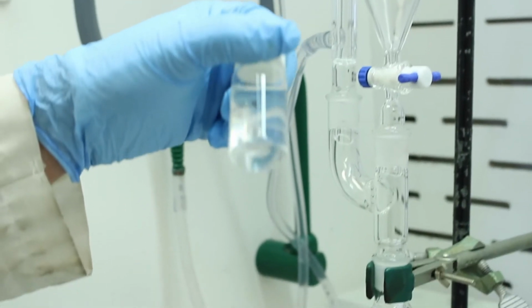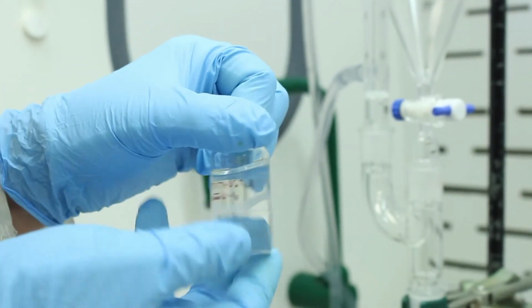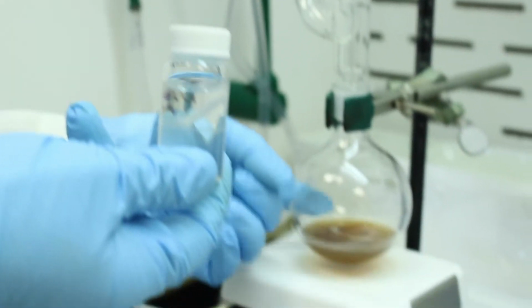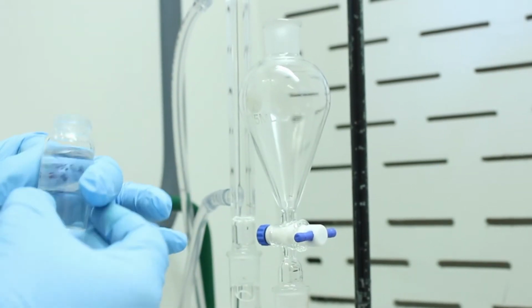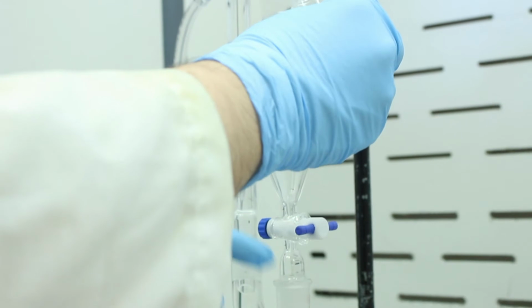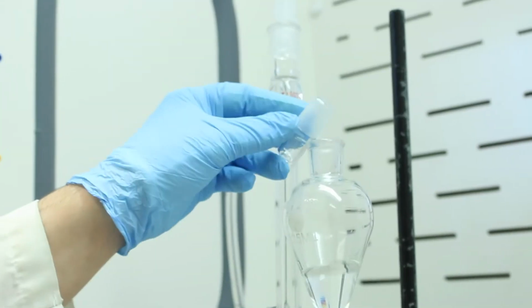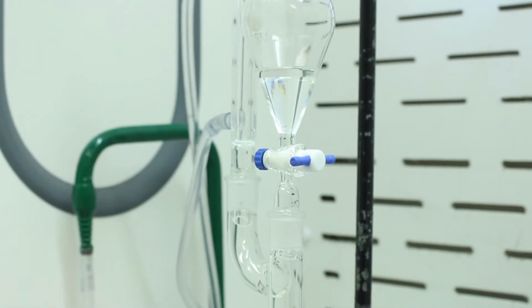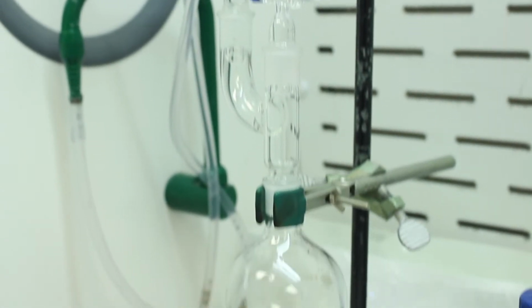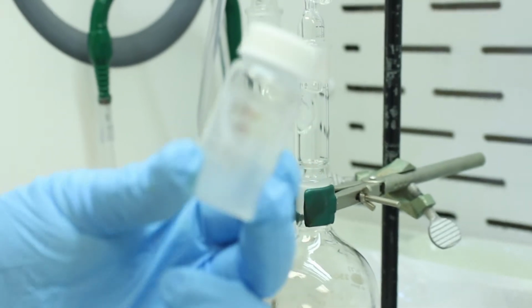In this vial we have benzophenone dissolved in diethyl ether. So benzophenone is the electrophile which will react with our Grignard reagent, and we'll add the benzophenone to our sep funnel here. Okay, and make sure the stopcock's closed. Okay, so we've charged it into our sep funnel, and now we're going to add it. So when we add it, oh, you can even see some of the benzophenone residue here on the vial.